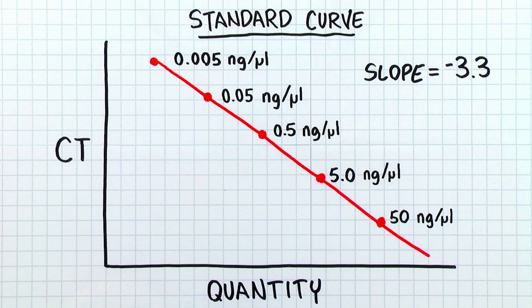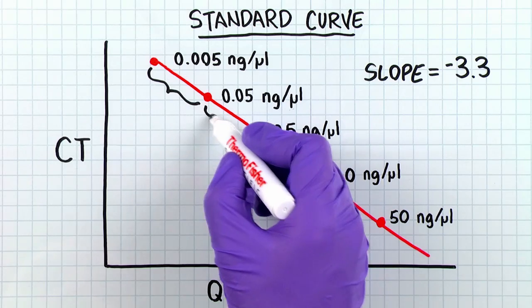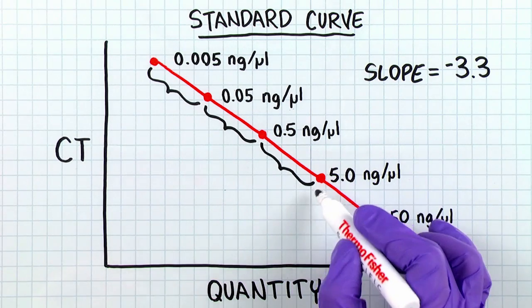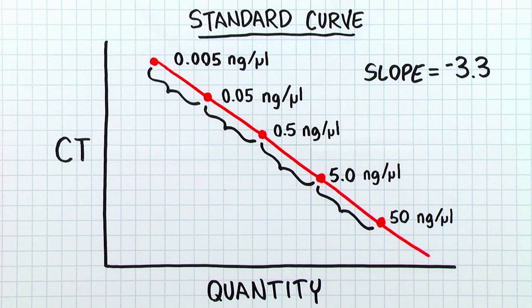Because the standards are 10-fold dilutions, we expect the change in CT from one standard to the next to be uniform. An uneven distribution of CT values might indicate that the dilution series was not accurately pipetted.